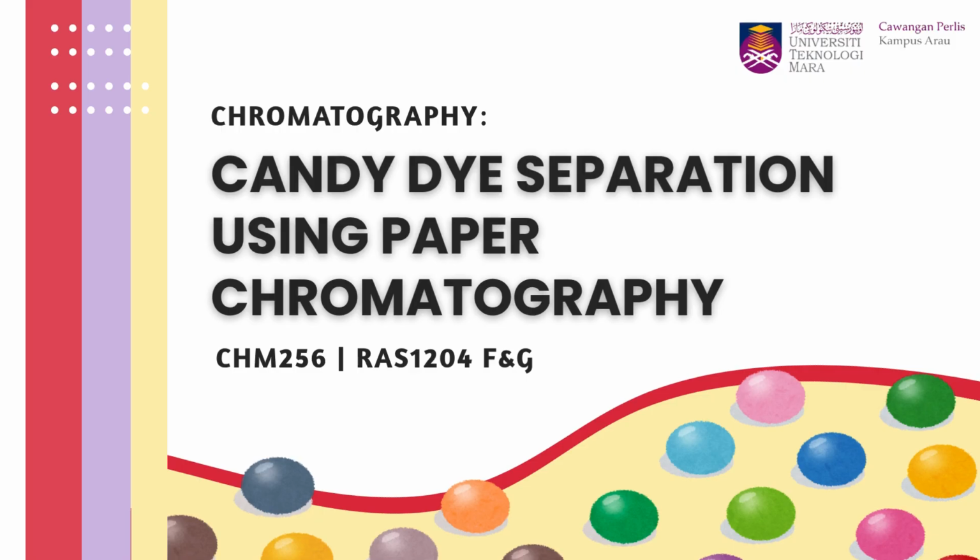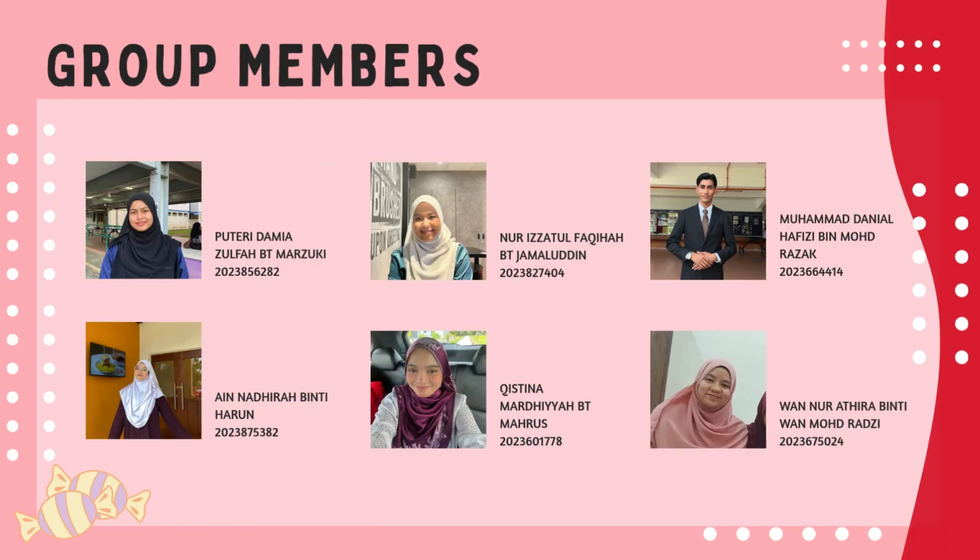This experiment focuses on separating dyes found in candies, which are actually quite similar to food dyes. That's why we chose to use food dye in our experiment as a representative sample. Before we begin, let me first introduce our group members.